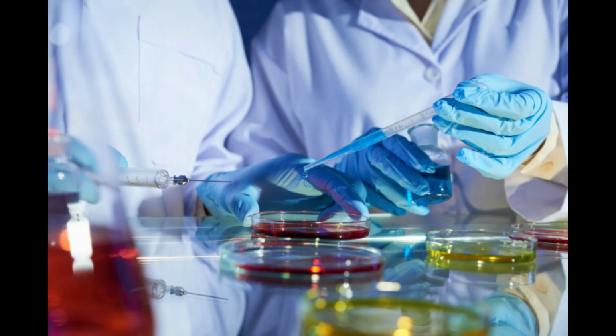Maybe not today because y'all aren't fixing to do this lab, but when you get to this point in lab on Thursday, either draw a circle just like I did on a sheet of paper, or there's a practice page on page 51 in your lab. Do it with a pencil or a pen first. It's awkward. It's very awkward to do it. Do it with a pen or a pencil first. Make sure you've at least got some practice with it before you try it on a plate. Okay?